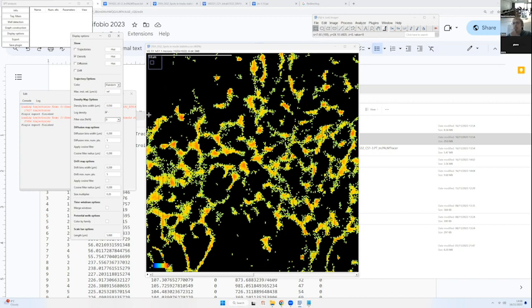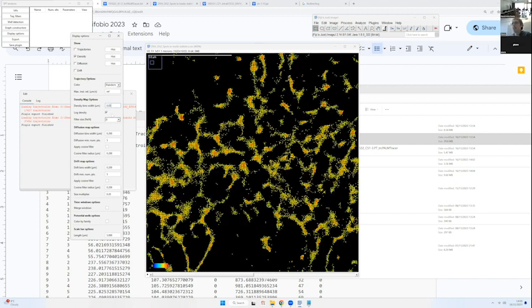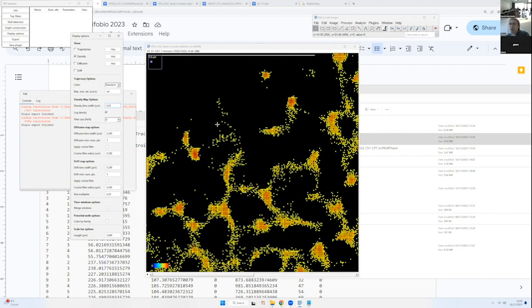All right, and finally, the last option we have is if we want to apply a filter on the map. So let's say, for example, I go even lower in terms of bin size, so 0.03. Now I have a lot of noise, a lot of variance.